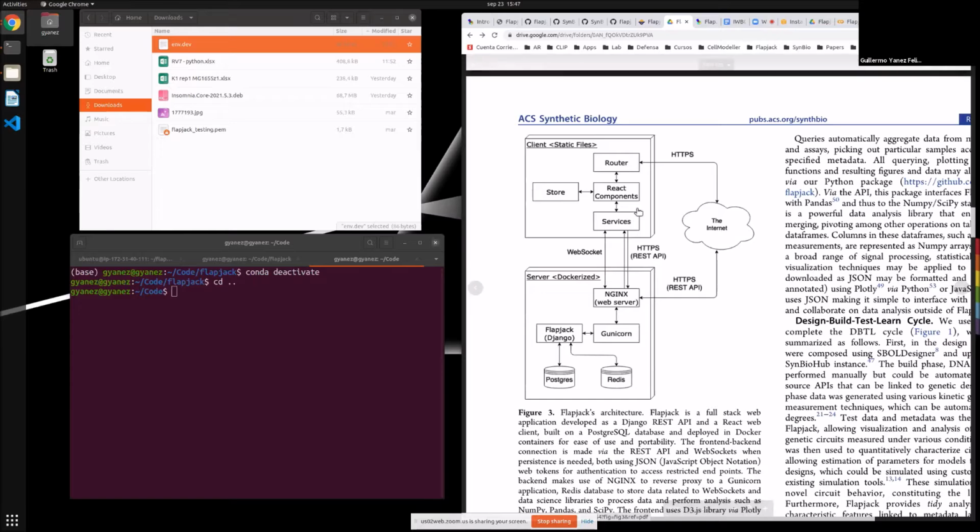So you don't need the front end. Actually, it's slower. When you have the Python API, you just go to a notebook or a script, and then you start retrieving your data, uploading data, performing analysis. So it's much more efficient for people that have some regular Python skills.